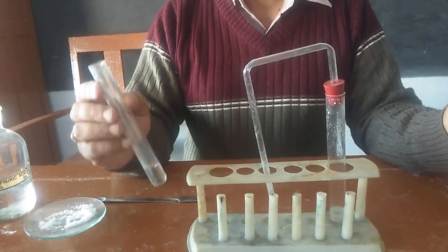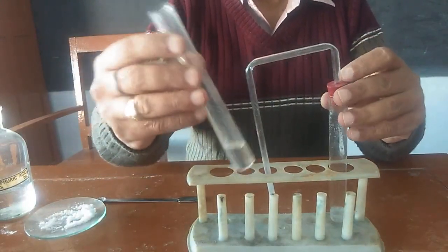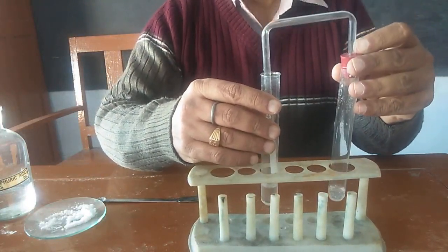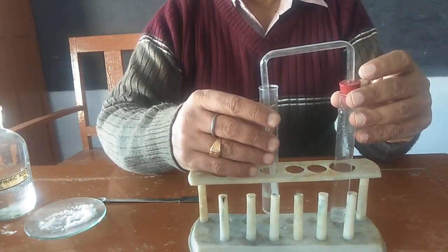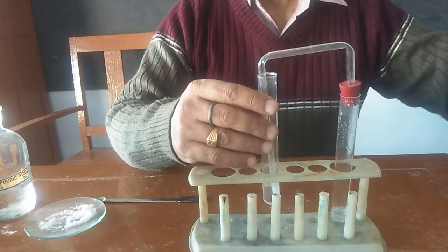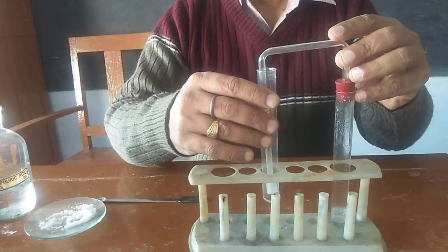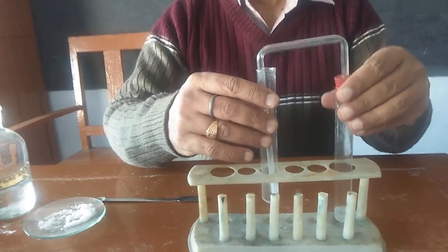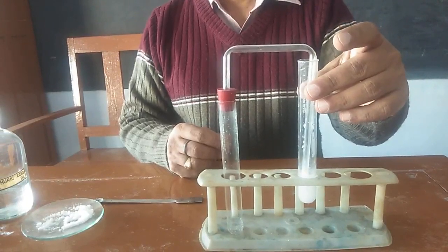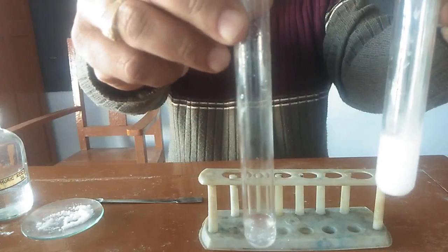For the confirmatory test of carbonate ions, we will pass carbon dioxide gas through lime water. The formula of lime water is Ca(OH)2. As soon as the carbon dioxide gas comes in contact with lime water, it turns milky due to the formation of calcium carbonate. We will wait for some time because this process takes 1 or 2 minutes. After a few minutes, the lime water turned milky due to the formation of CaCO3, or calcium carbonate.